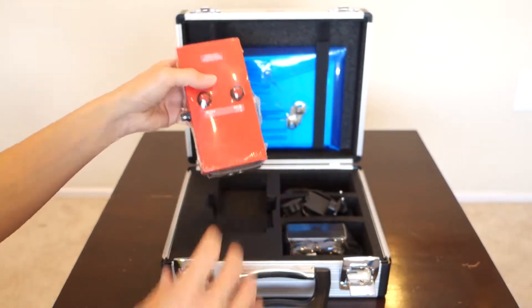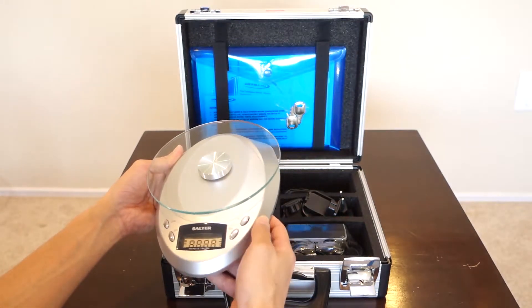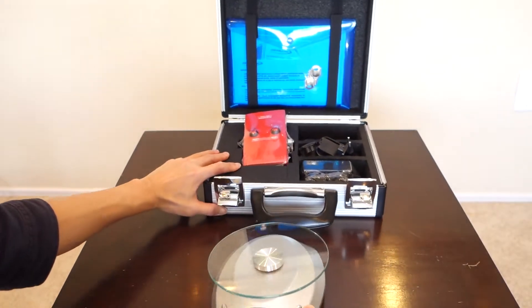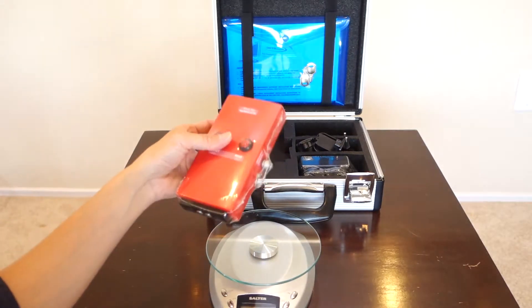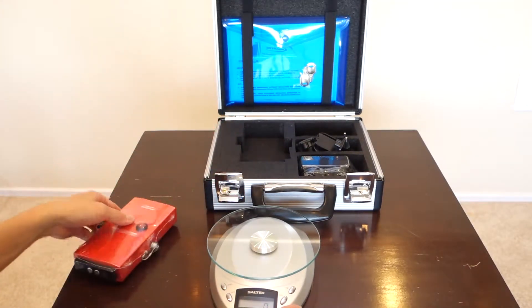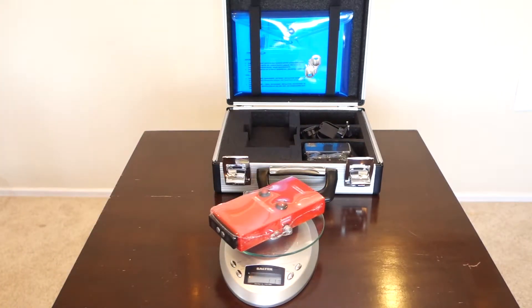I've brought in a small scale just to show you how light it is. I'm going to push the box aside, let the scale reset to zero, and weigh it. It reads 11 ounces — and if you're into kilograms, that's about 0.33 kilograms. So it's very light at 11 ounces.